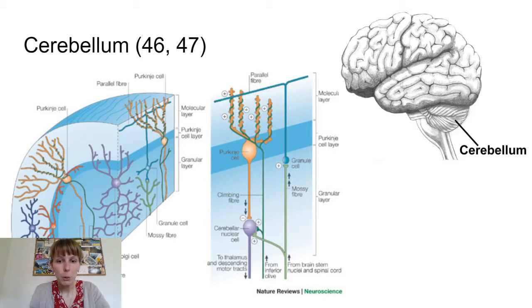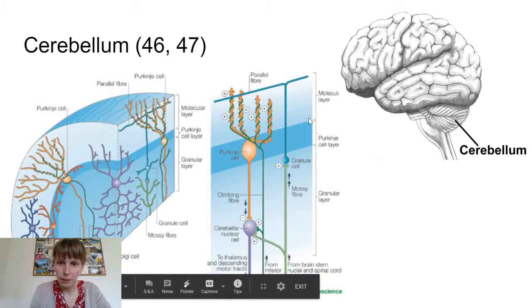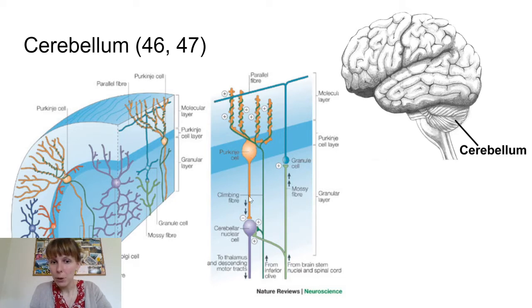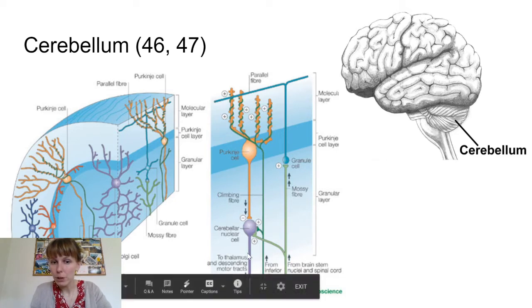So you will have white matter, and then you will have the gray matter, the cortex as well. So this is the whole cortex here, and it will have 3 layers. The outer one will be the molecular layer, then we will have the cell bodies of the Purkinje cells, these huge neurons, the Golgi type 1, and they will be forming axons going away into the white matter.